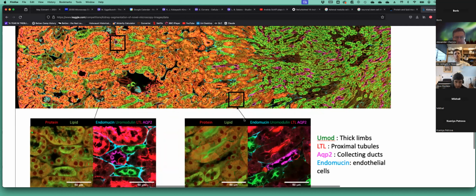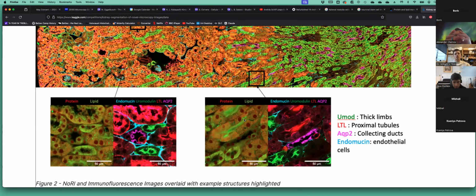When you said proteins, that means all the proteins, because we have 20,000 proteins? No, we're talking about three or four here. Right, that's right now. Will is zooming in to the relevant proteins. Those are just four stains, which pretty much define the type of element, right? Will, maybe you can explain why these specific proteins. But these proteins, are they different for different pictures, or are they always the same?